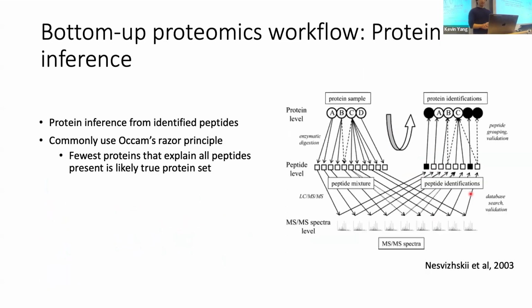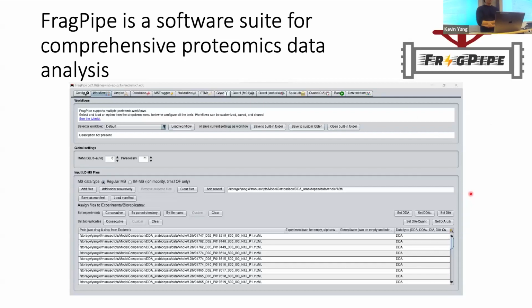And then from there, you have your peptides. You can infer your protein just by saying what protein sequences are those peptides from. Let's take a look at that. Any questions so far?